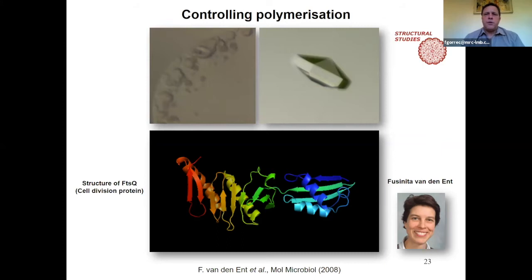So we are talking about dozens of constructs here to finally be able to successfully crystallize this protein. And obviously, this is not a work only on constructs, but also some work on optimization of purification and concentration. So it can become a lot of work. This part is very tedious sometimes, but it's necessary.